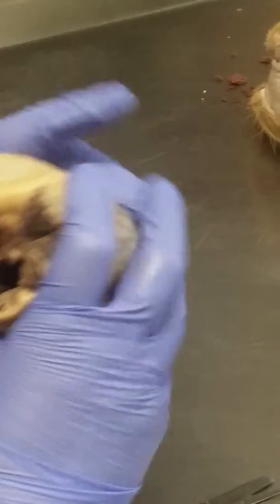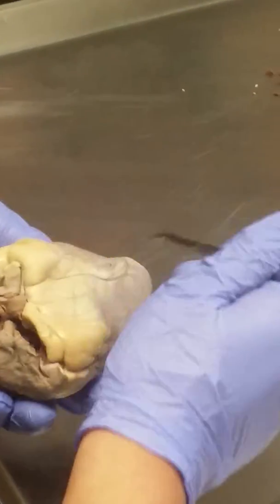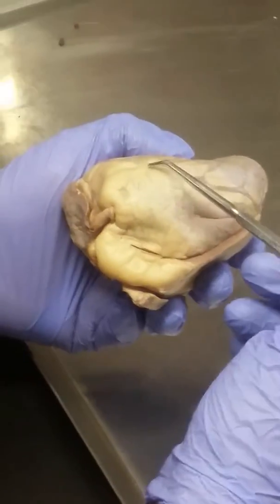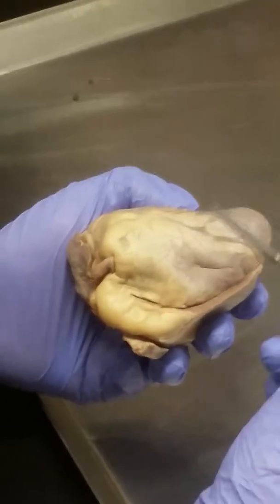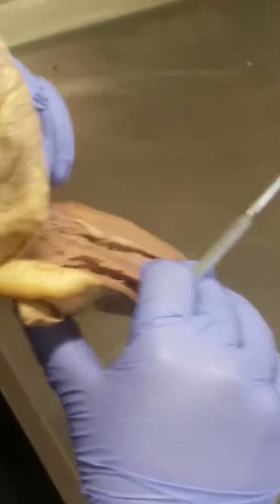What do you guys think? Well, notice here, there is a diagonal vessel coming this way. And notice over here, this one's going straight down. Well, this is the anterior interventricular branch of the left coronary artery. Which means that over here should be the right ventricle and over here should be the left. Let's check. Oh, would you look at that?